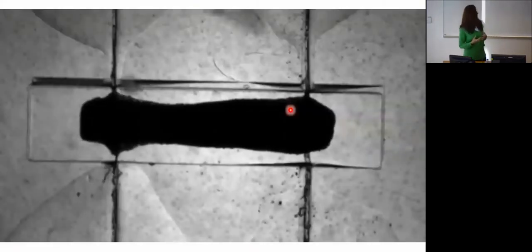It is contractile, it's beating. But these polymer wires, besides being flexible, they are also autofluorescent, which means that now if you just image everything, it's kind of bright in this room, but if you look right here in the middle of the wires, you can see some deflection that is the result of tissue contraction. So now your image is not obstructed by the presence of the tissue itself.